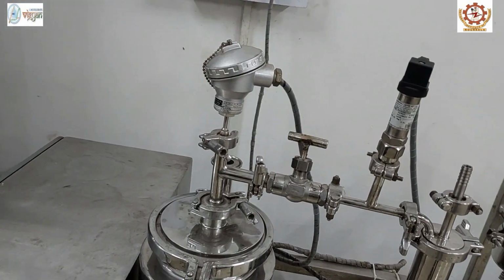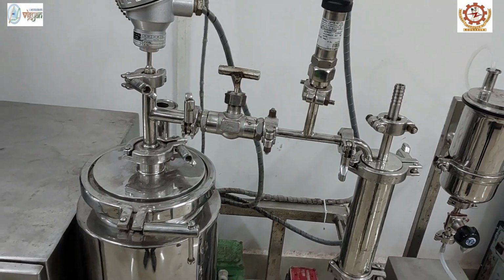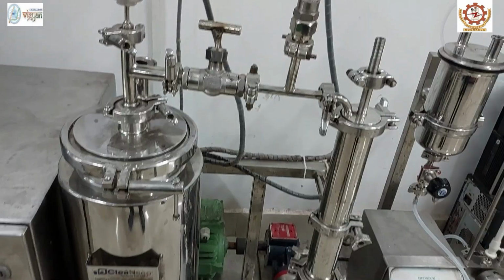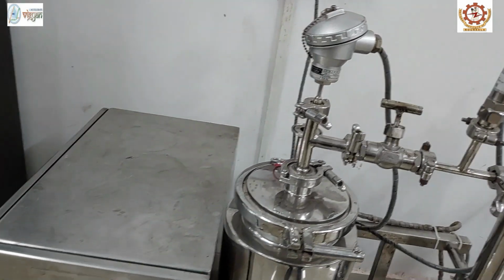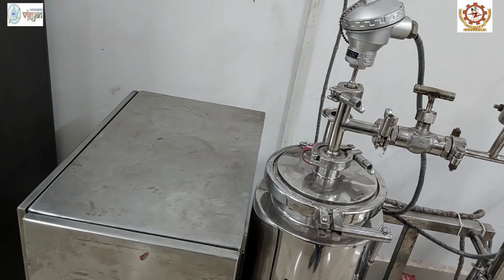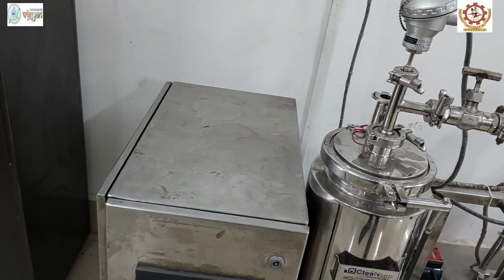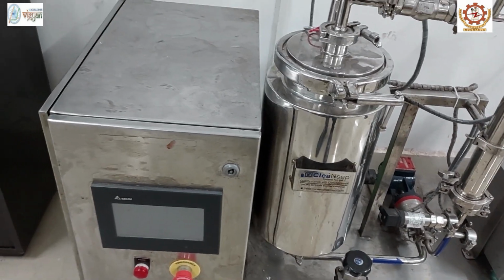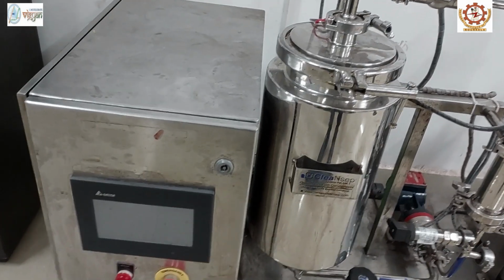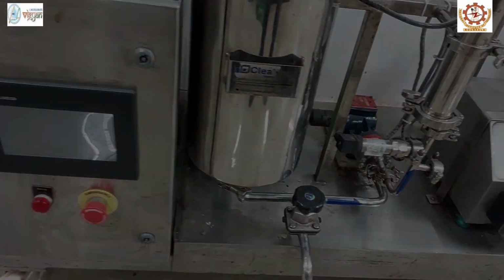It is used for desalination, purification, concentration, and separation. Reverse osmosis is recognized as the most effective method for the elimination of chemical residues, dissolved salts, and inorganic components from water. It can also combine with other filtration techniques such as ultrafiltration and microfiltration.